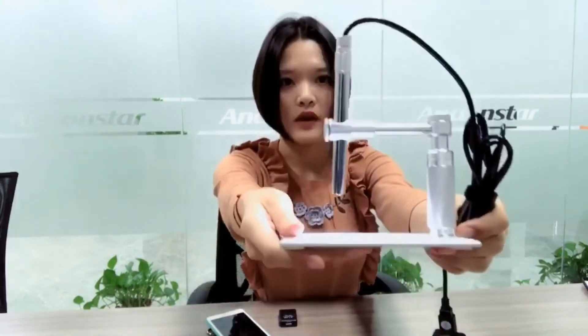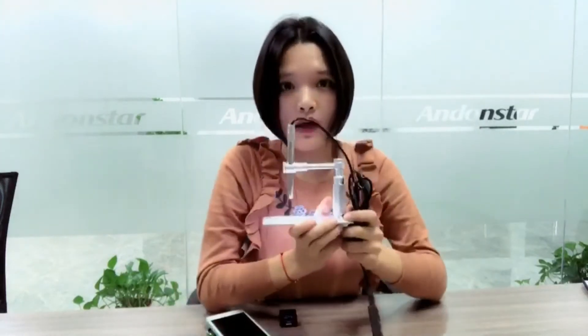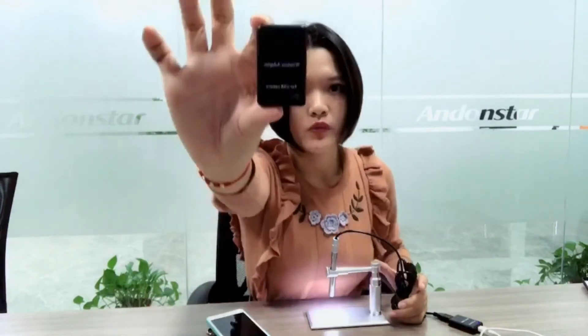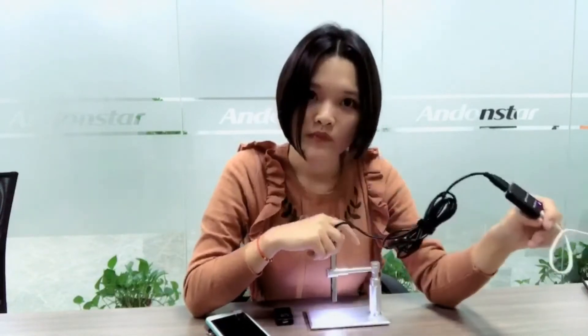Hello everyone, some of you probably know this is our old model A1, it's a USB microscope and it can only be used when you connect it to your PC. But this time we got a new model — a new Wi-Fi adapter, which is this small black box. It connects the USB microscope to this Wi-Fi adapter, and then you connect it to the power supply, so you can share the view from this microscope to your phone or tablet.